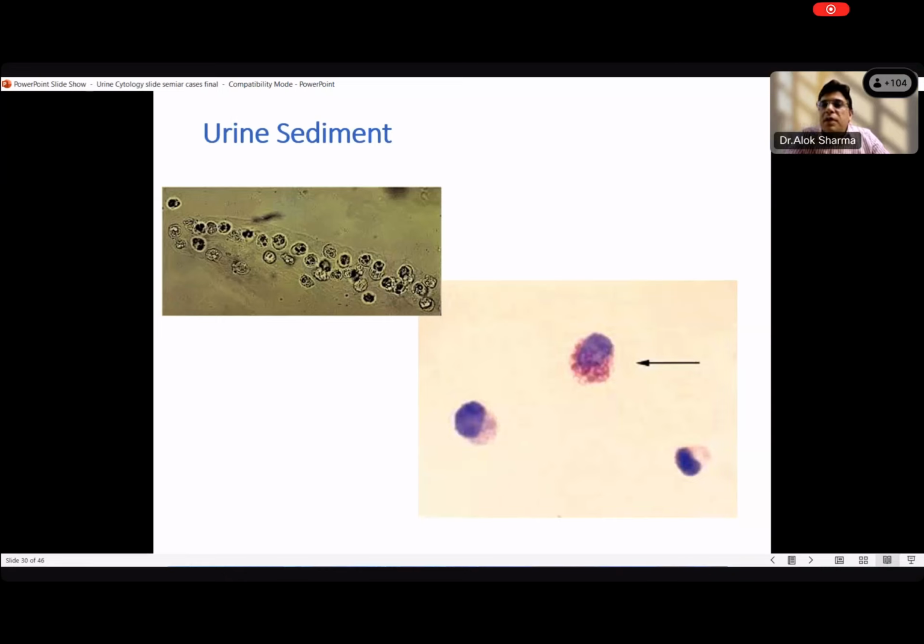So probably you'll use a special stain. If you were in the last class, you would have come up with it. But your answer is that... Yeah, I'm not sure, sir. Okay, so it's the Hansel stain which you use. So you can go back to the previous lecture, have a relook at it. Then you should be aware of which special stains to use in which specific conditions.